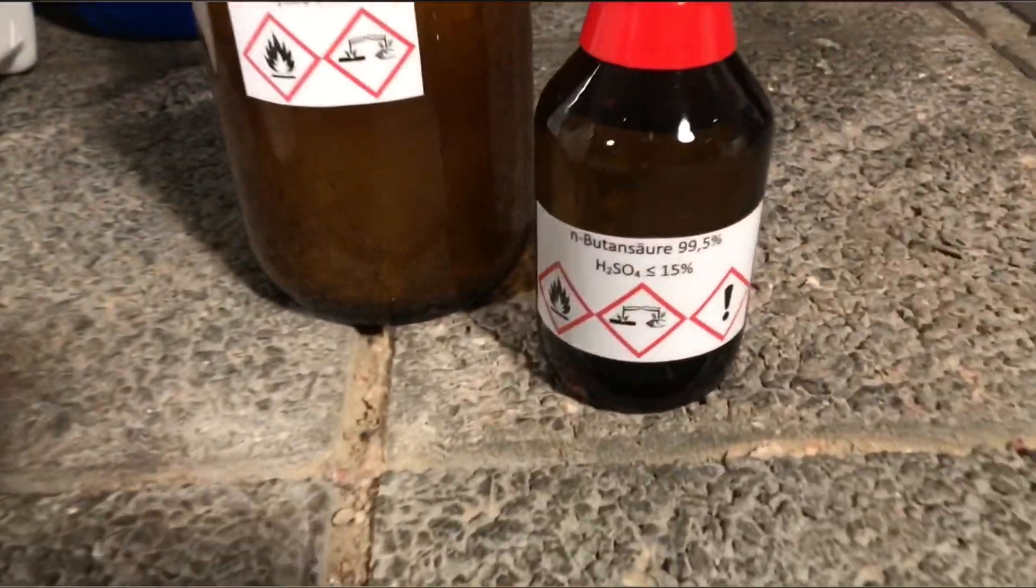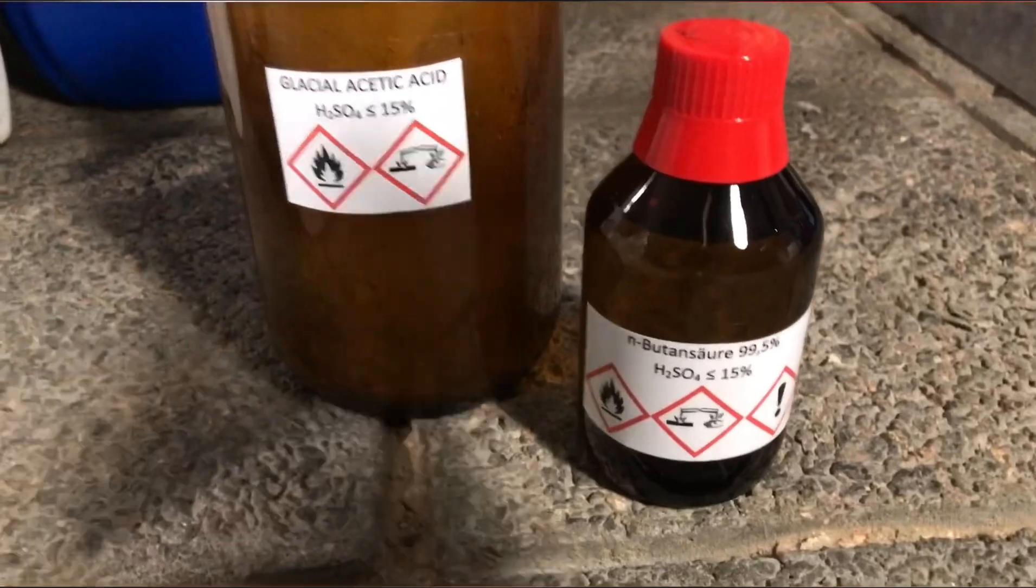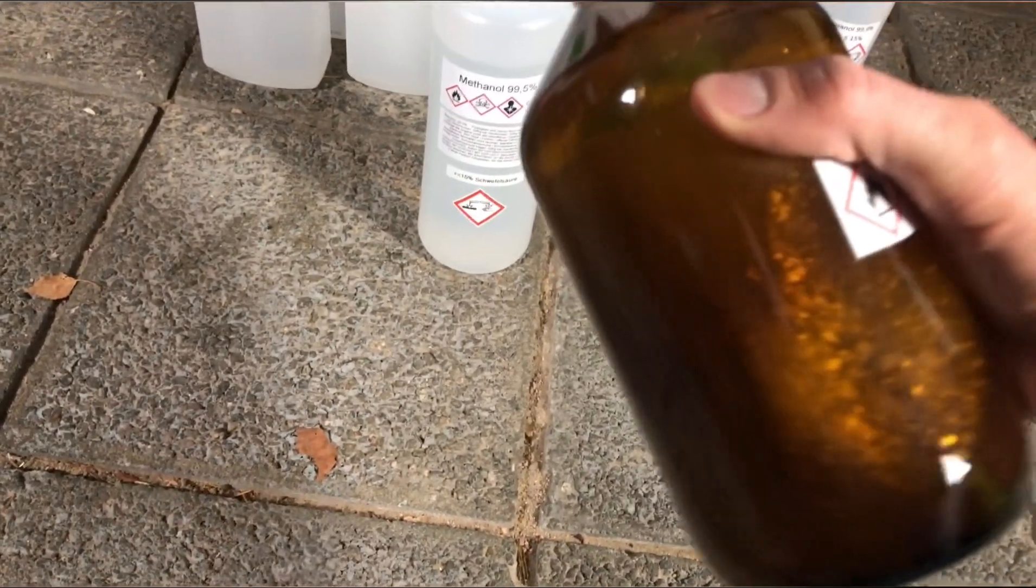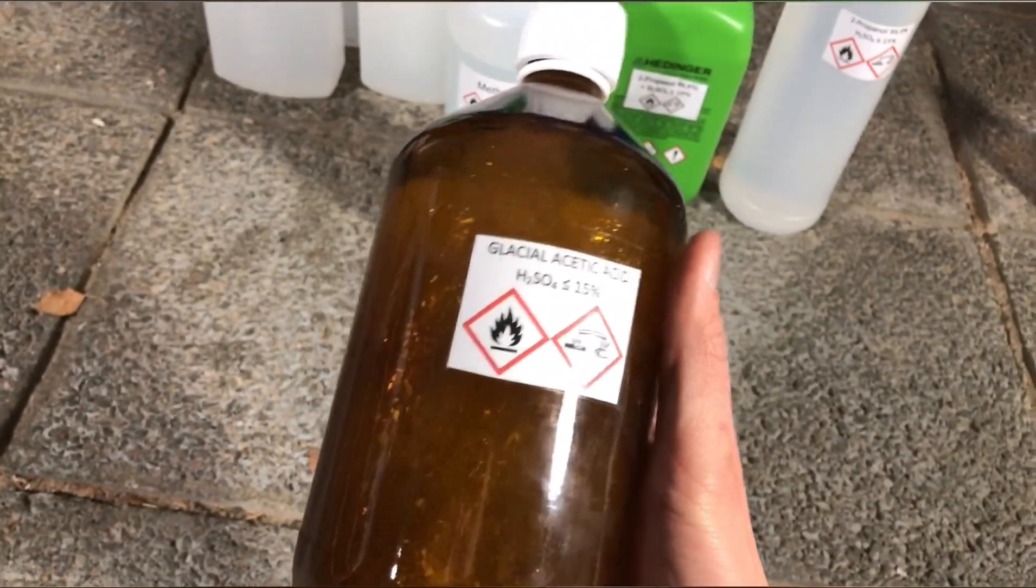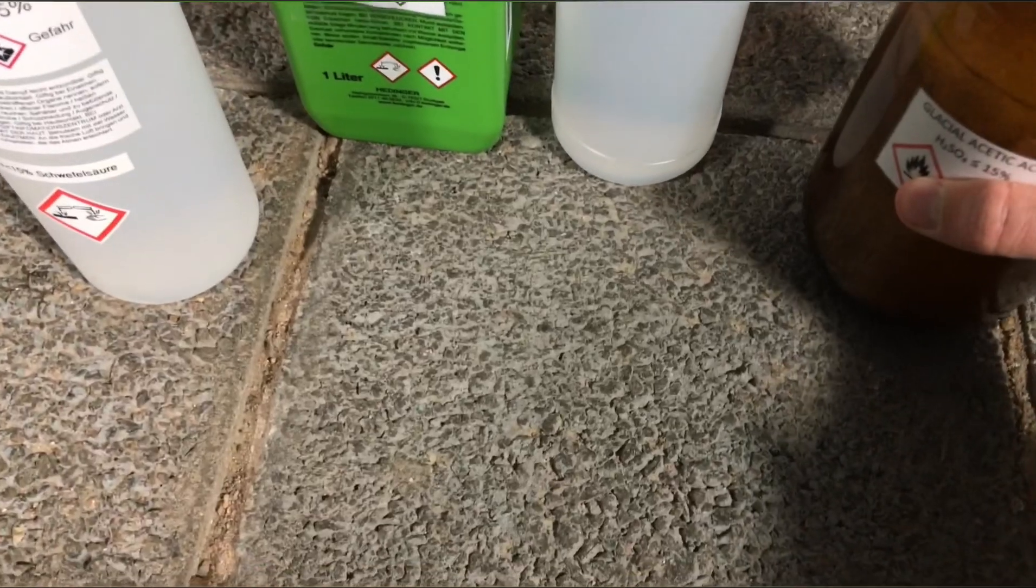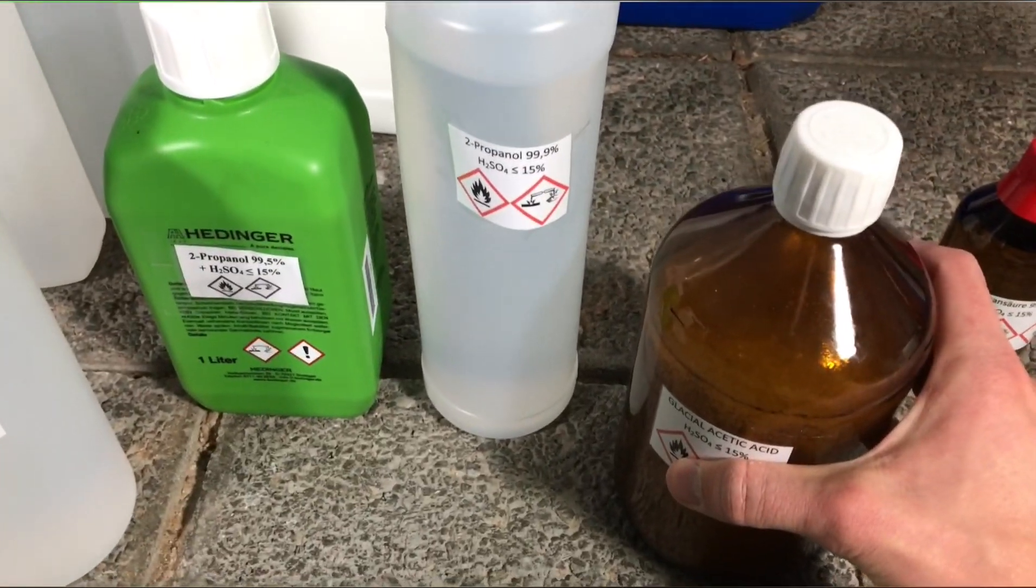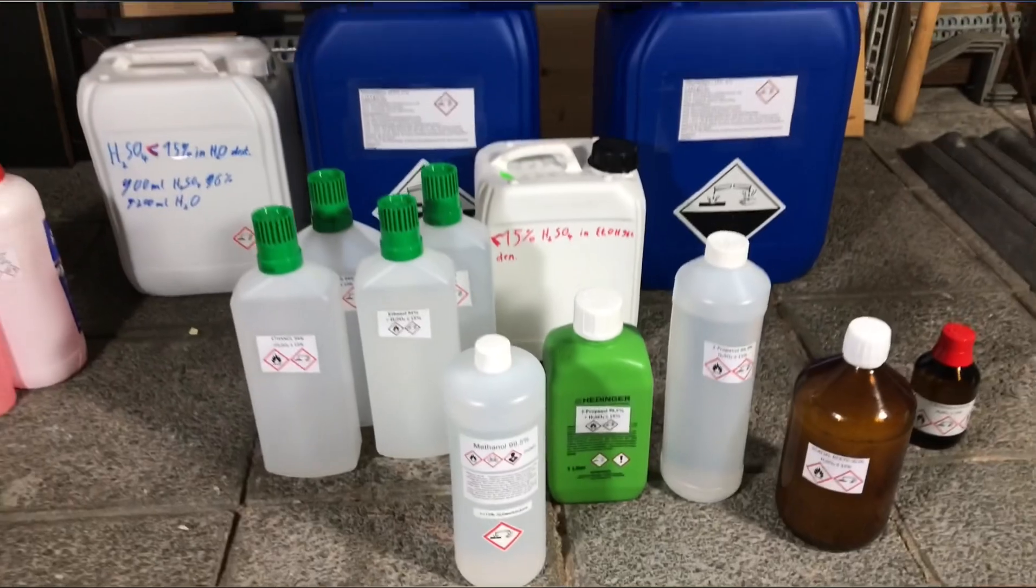Besides that, we also have sulfuric acid in butyric acid and in glacial acetic acid. The glacial acetic acid containing the sulfuric acid actually still froze. The acetic acid froze because it still contains little to no water. Without water, it forms hydrogen bonds which lead to this high freezing point.